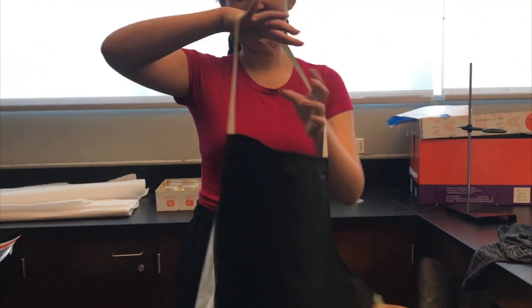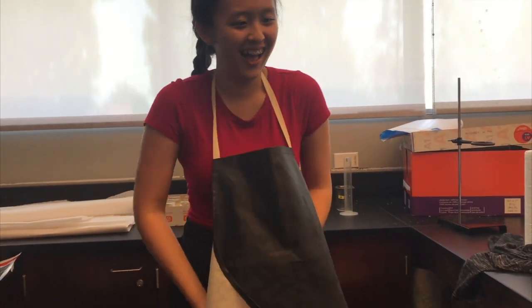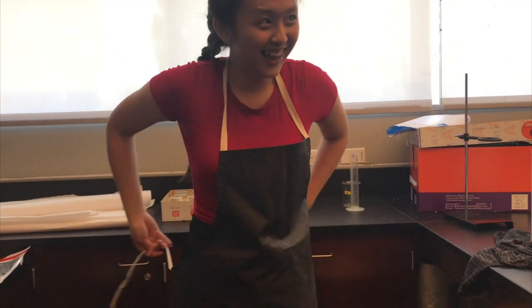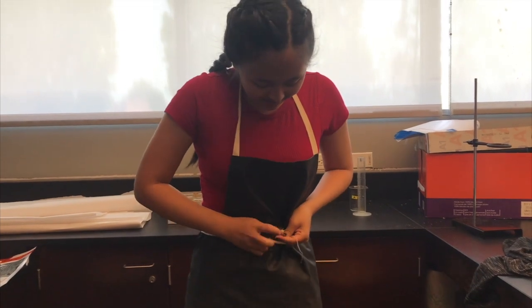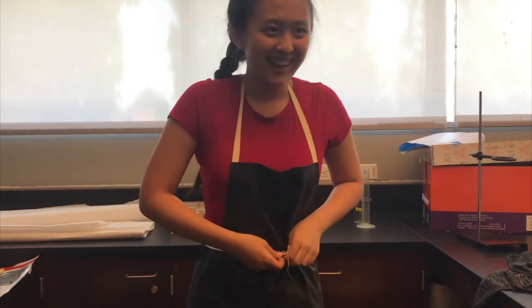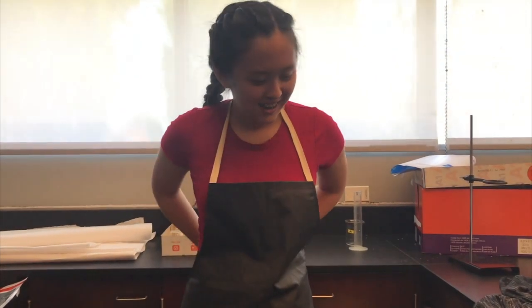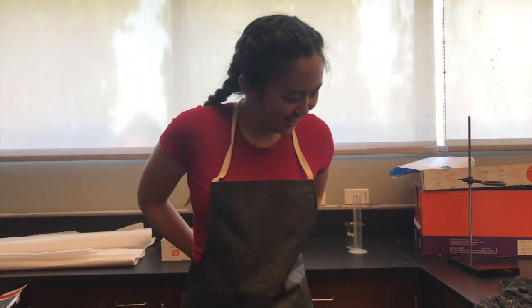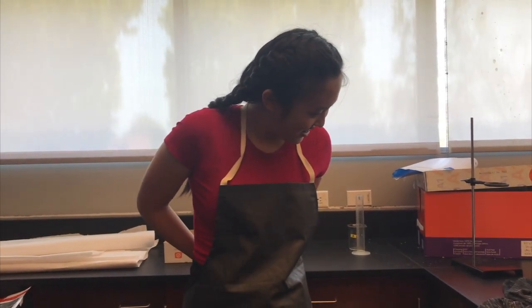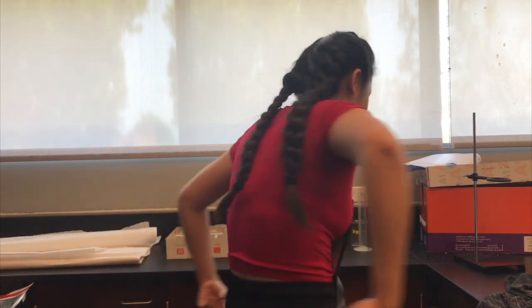When performing laboratory experiments, you should always wear a lab apron. They are so important because they help protect your torso. And when tying it, you should tie it at the back like a normal human being, and not at the front. And remember, if you don't know how to tie it at the back, get some help on the first day. Don't figure it out by yourself, or you will be shamed. See?